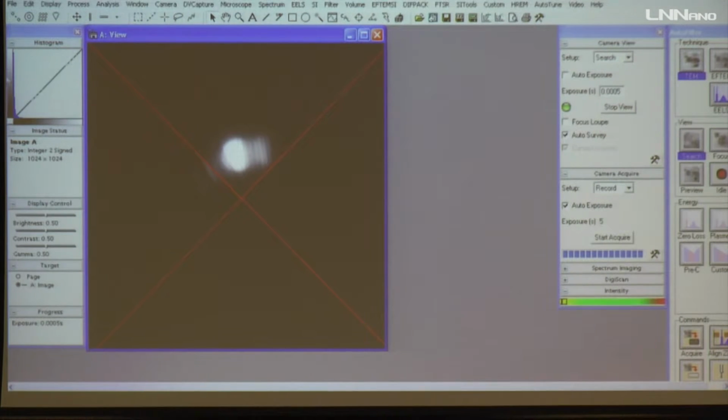And you see here, this is the whole ring, but I will show you proper ring. Now, as it is not exactly in the correct orientation, we see that it's a kind of morning sunrise. So I will try to get it in the zone axis.